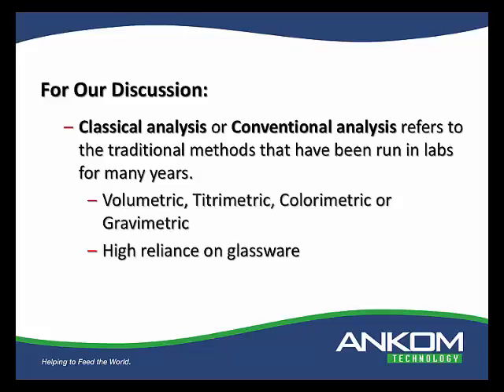All right, so that we're all on the same page, I'm going to use classical, conventional, I might even refer to manual, and Chris will do the same thing. Anytime classical, conventional, or manual is mentioned, we're talking about the traditional method that is done in the laboratory on the bench top. Generally it uses a lot of glassware. It's time-consuming, it's tedious. They can be volumetric, titrimetric, gravimetric. There's a lot of different categories.